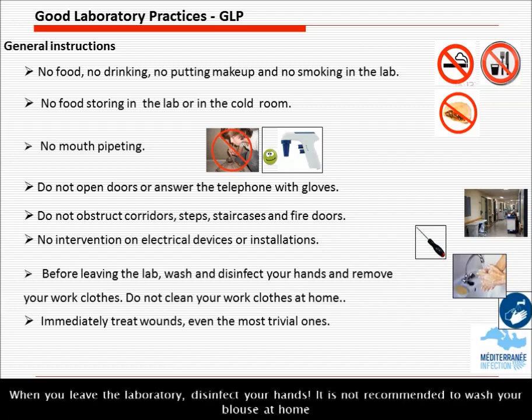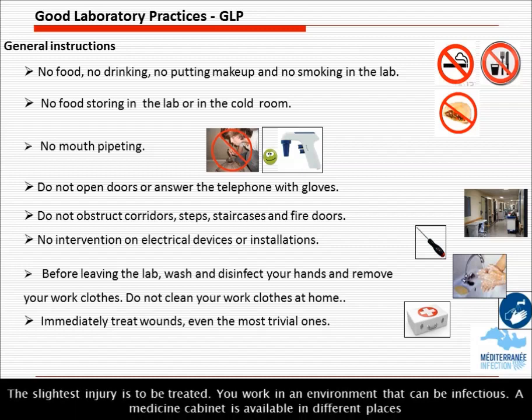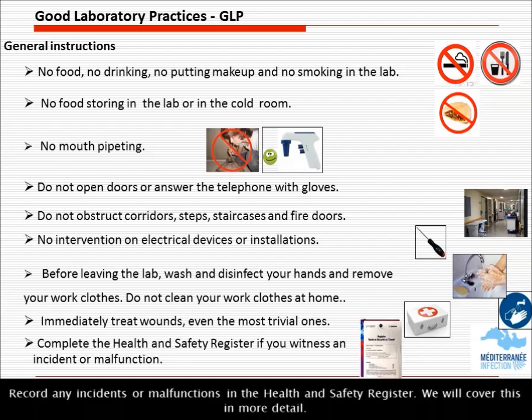When you leave the laboratory, disinfect your hands. It is not recommended to wash your blouse at home. The slightest injury is to be treated. You work in an environment that can be infectious. A medicine cabinet is available in different places. Record any incidents or malfunctions in the Health and Safety Register. We will cover this in more detail.